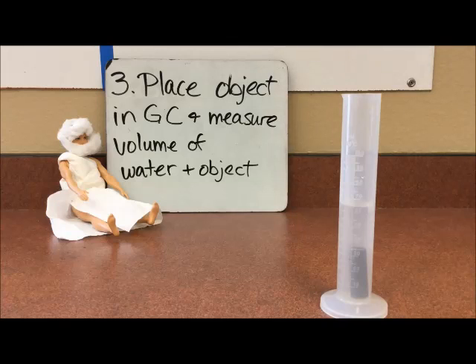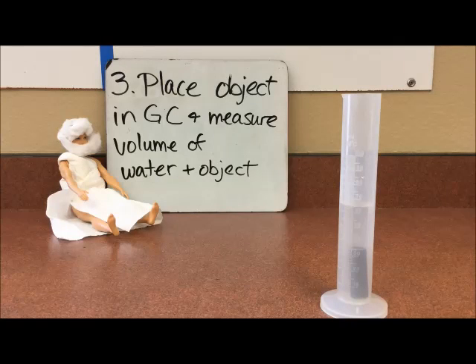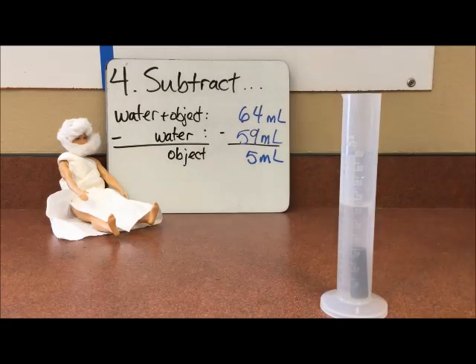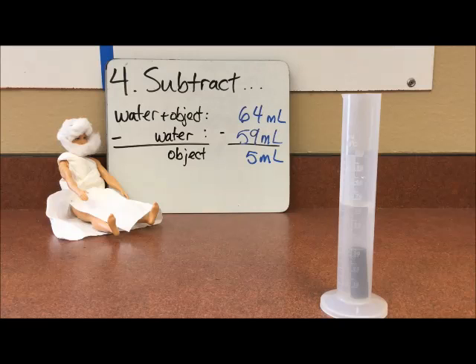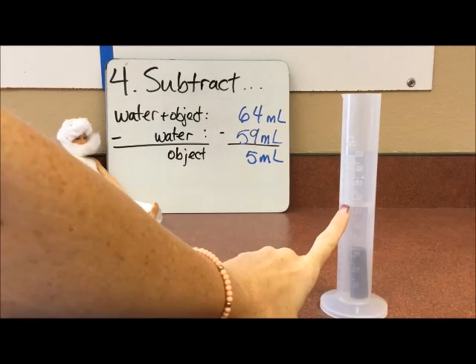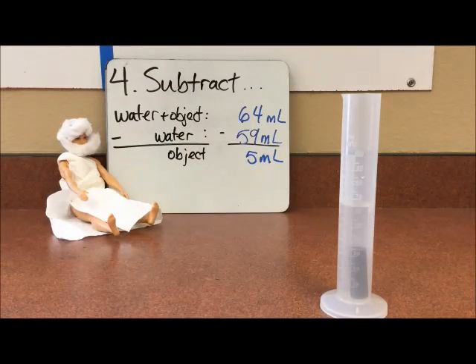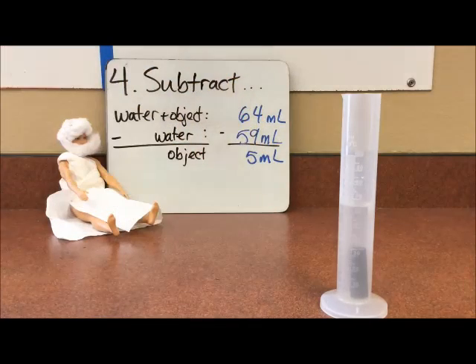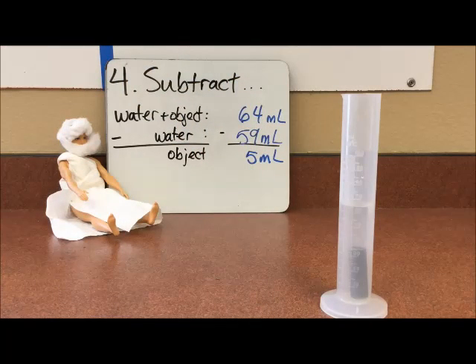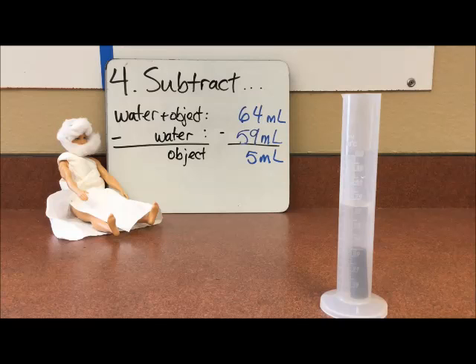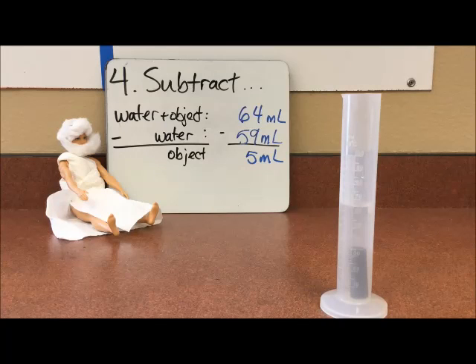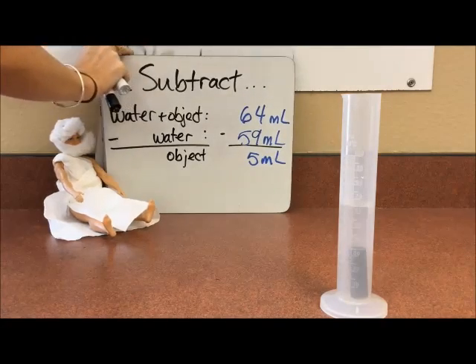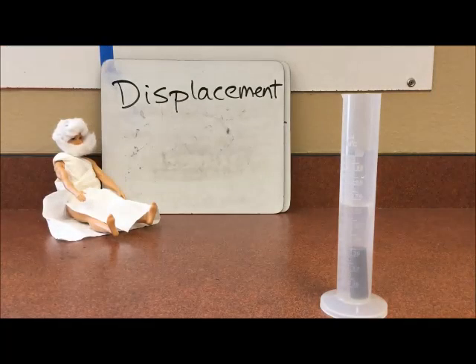So the last step that we have to do is a little bit of subtraction—thank Archimedes for that. We need to take the volume of the water plus the object, which right now is at 64, and then subtract the initial amount of water, because we don't want to know the water plus the object—we want to know just how much space the object is taking up. So we're going to subtract the 59 milliliters of the water and we are going to record on our data table that the object has a volume of five milliliters. That is how we find the volume by displacement. Thanks Archimedes.